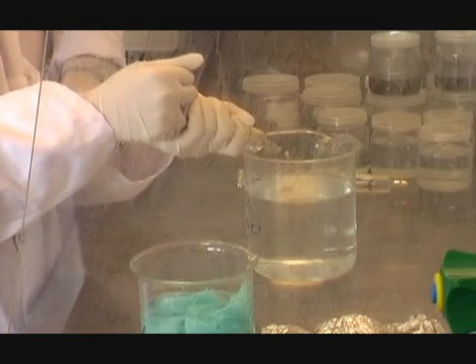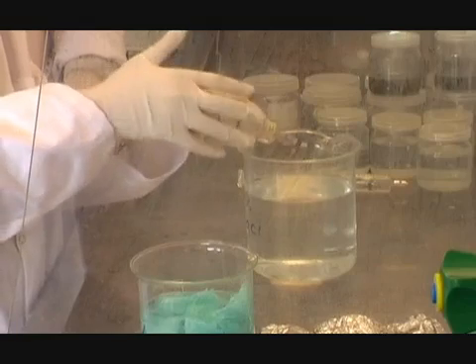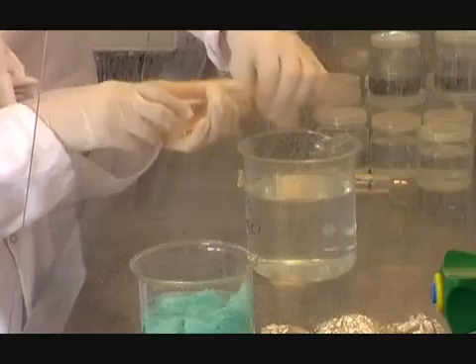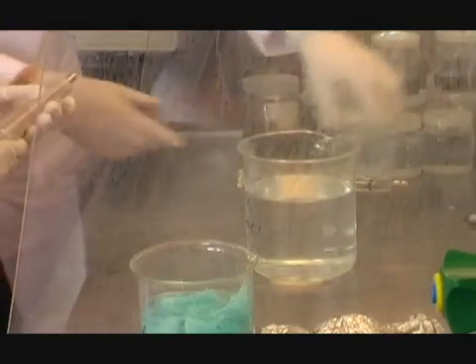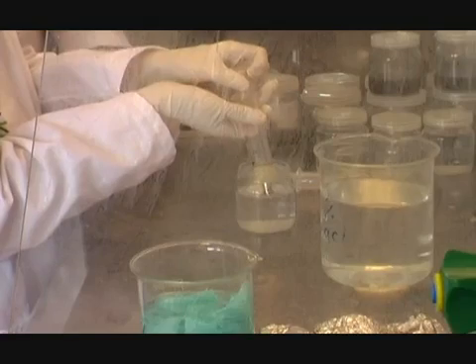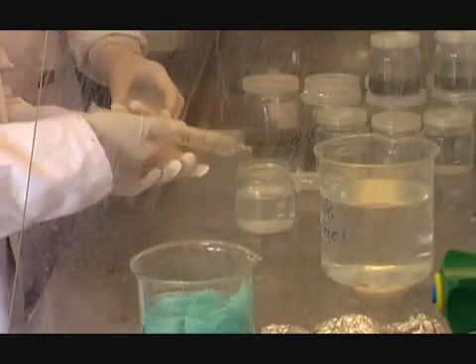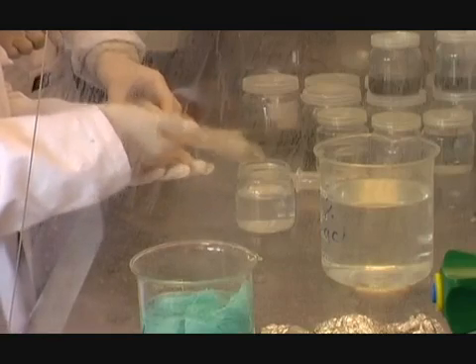After 15 minutes we need to rinse the seeds. First let them float to the top of the syringe, then squirt out the bleach. Now suck up the sterile water to wash the seeds. After three rinses the seeds are clean and they are sowed in agar.